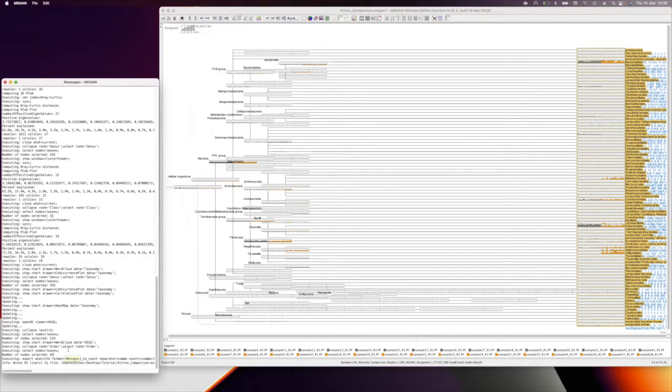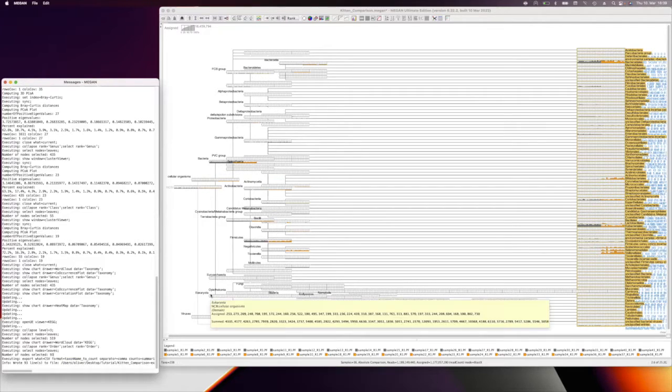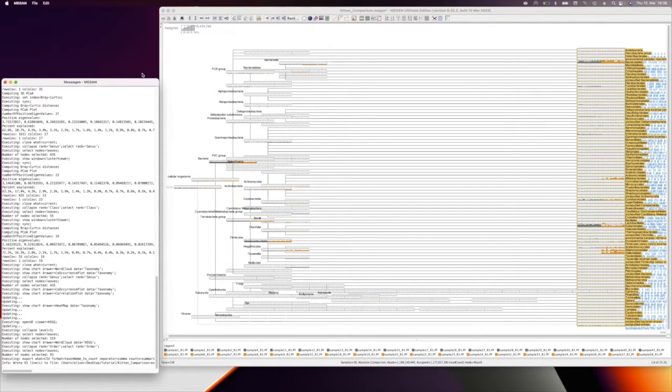So for example, I would like to export the counts for 6 taxonomic ranks of the NCBI database. And I would also like to export counts for KEGG abundance data on all 4 KEGG levels. And I will show you how I do this.